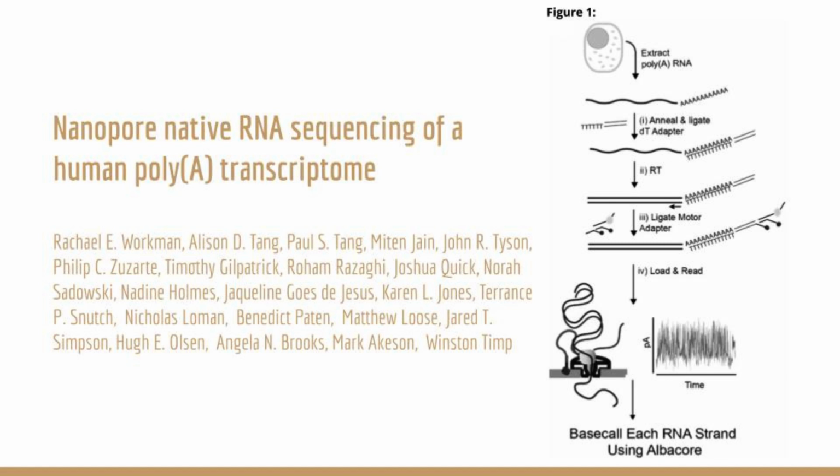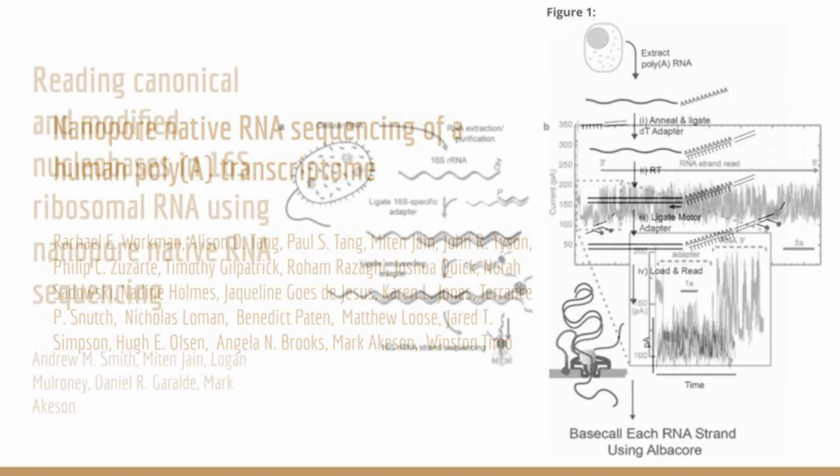I did mention that reverse transcription is not required. According to Workman, the generation of the complementary DNA with reverse transcription was not required. They did it to improve the throughput.